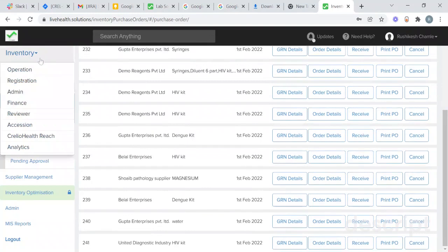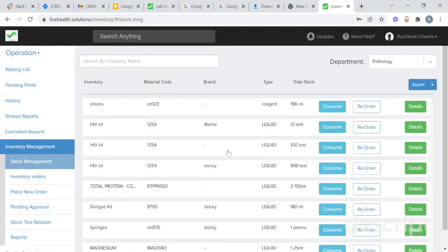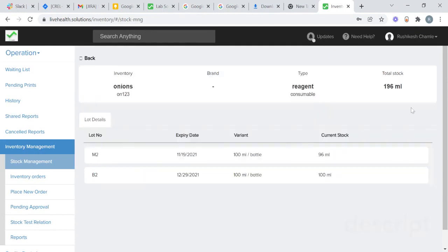To go to department level, go to the operation section and go to inventory management, then go to in-stock management. You will see department stock. Choose the department — this is the current stock present at the pathology department. You will also be able to consume the particular stock manually, reorder, and in details you will get details of that particular lot and product.